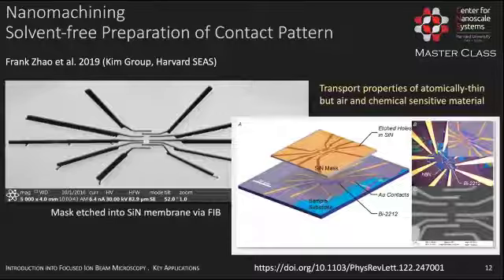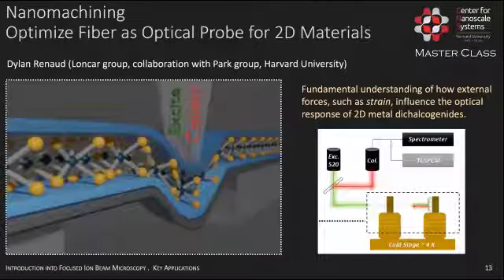Yeah, so you see that we have the tools to make more complicated patterns if that is necessary in your structure. The last example I'd like to show you is because it is a very simple but clever way of using the focused ion beam.